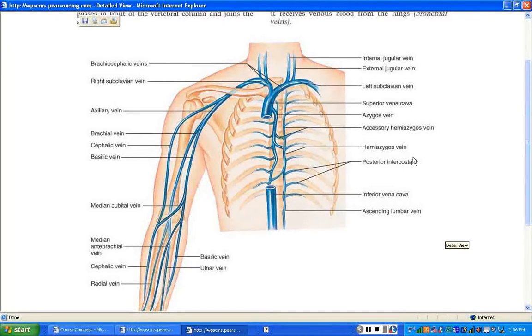And then right up here, skip a couple, you go to the azygous vein. Can you see that comes right out or goes right into, depending on how we're talking about it, the superior vena cava right there. That's where it goes. In reality, when we used to dissect cats, one of the cool things was you pick up their lungs and you look at the back from the inside. You're going from the front and you pick it up and look in there. Totally see that blood vessel running right down the spine. It runs right along the spine on the right-hand side.